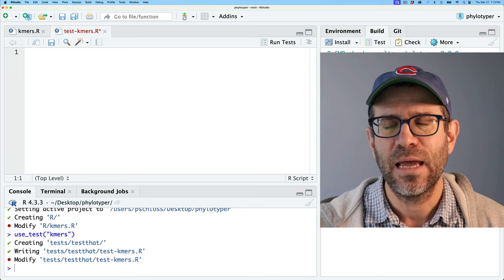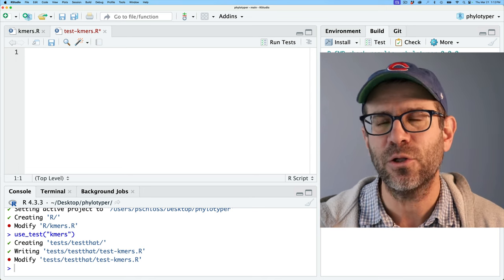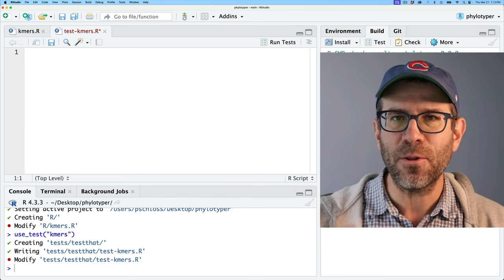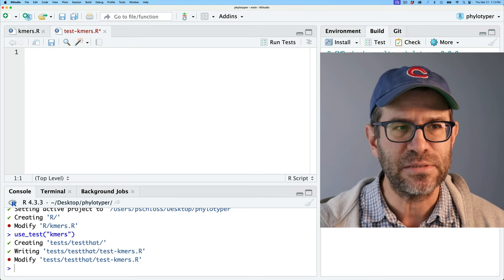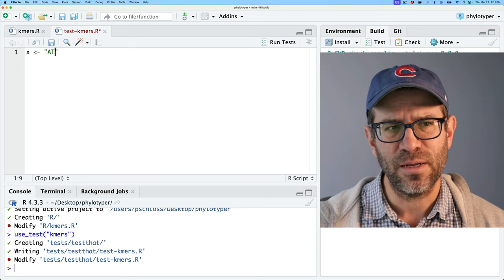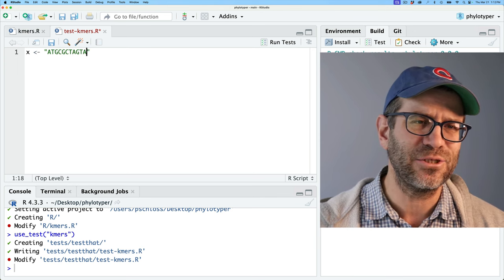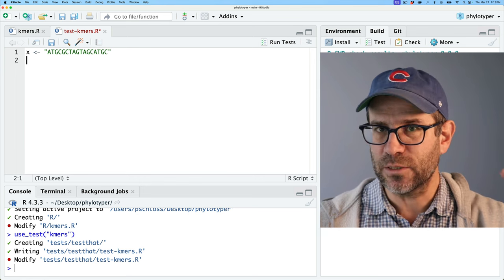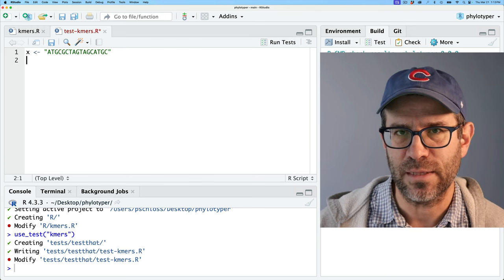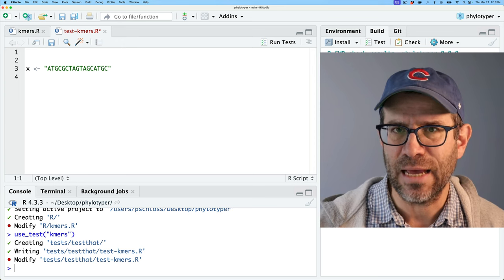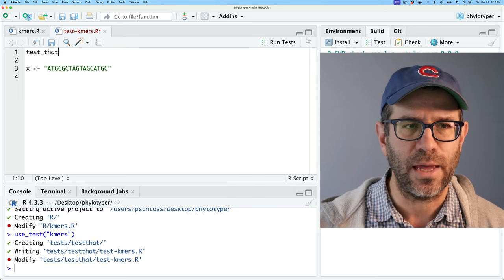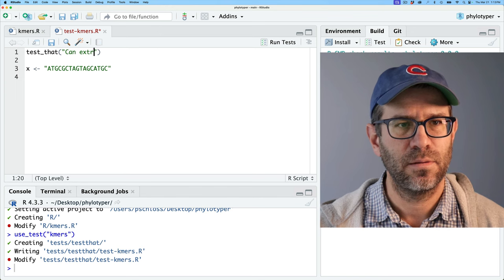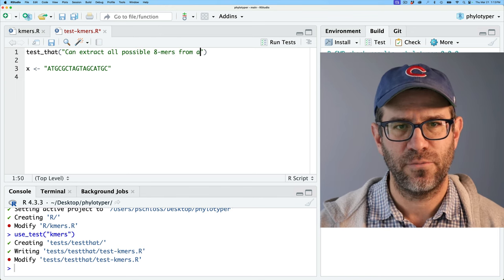The first function I want to develop is extracting all the k-mers from my sequences — a fundamental part of the naive Bayesian classifier. So if I have a sequence — say I call that x, and I randomly put in some A's, T's, G's, and C's — I want to be able to extract all possible eight-nucleotide words from that sequence. I'll go ahead and start with a test: test_that('can extract all possible 8-mers from a sequence', ...).